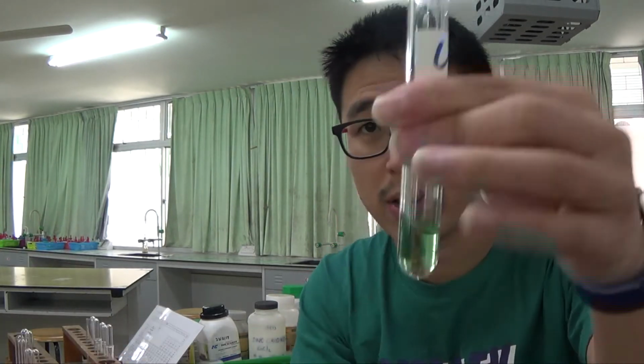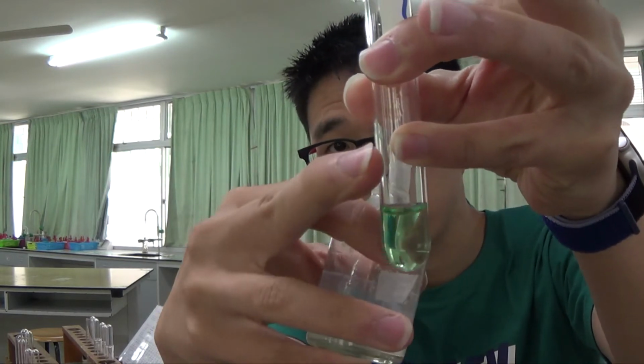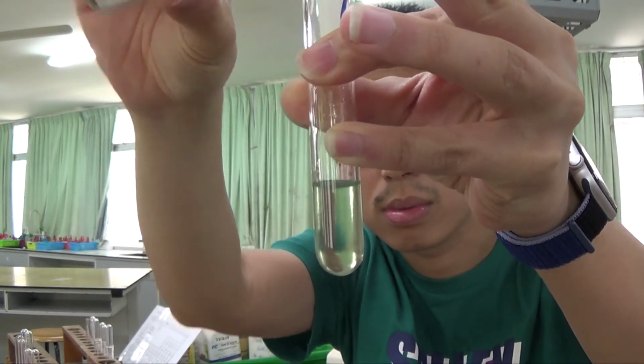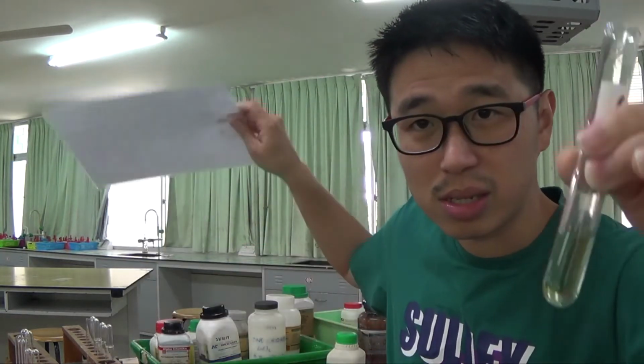I'm slowly running out of solution actually. I should use the dropper, but I roughly know this is the solution I have. I should add an equal amount, around my finger length there. Oh no, it is not very clear at all. I think it's because my solution is very dilute, but I don't know if you can see it or not.